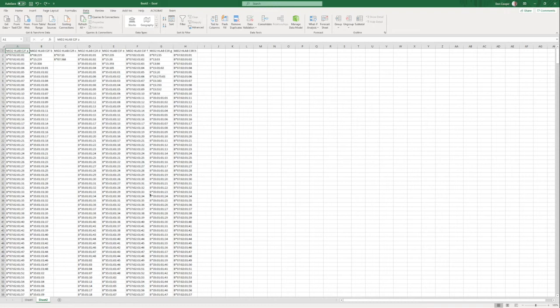Welcome back. Here we have a file which contains the allele calls for the 8 consensus sequences that we generated for mid-2 HLA-B. And now you'll notice that we have up to hundreds of alleles which were perfect matches for some of the consensuses. What we need to do is combine the data from exon 2 forward with exon 3 forward, with exon 2 reverse and exon 3 reverse.